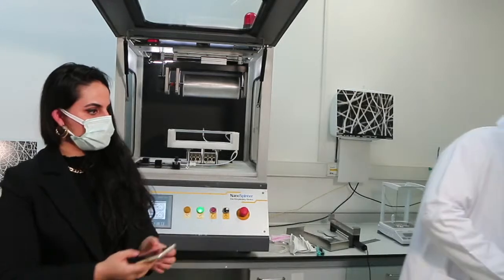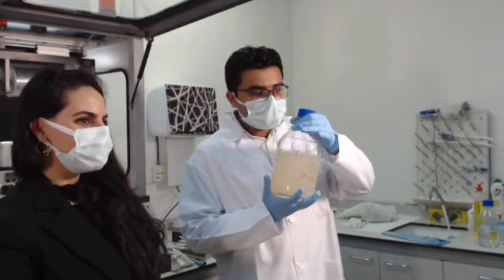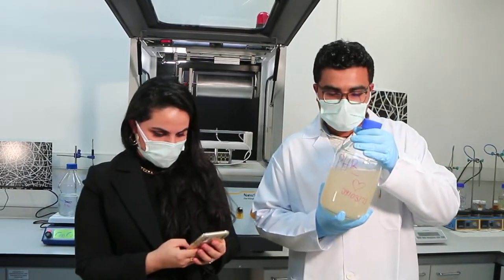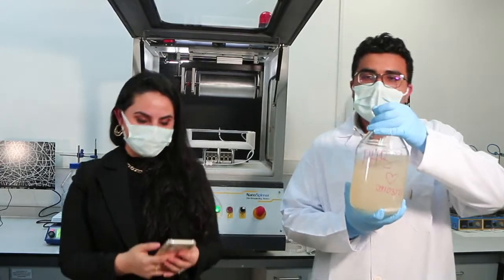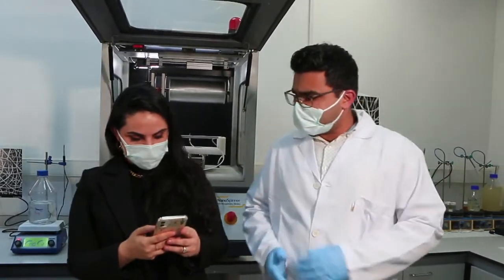Another one we can show you is recently made, that's why it's pretty hot. PHB. This is the biopolymer that we're talking about, the eco-friendly one. We're going to use this for further experimentation as well. You can see how viscous it is. So you're going to be dealing with a lot of viscous polymers, and you have to vary them.